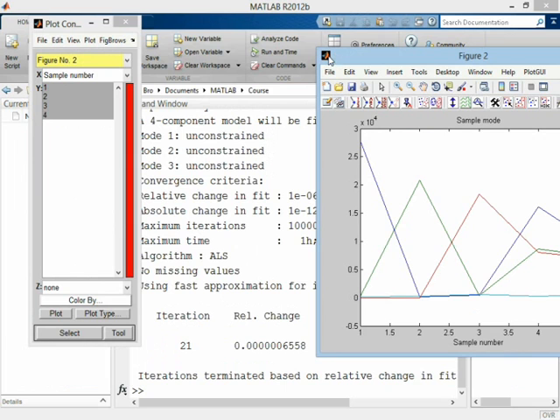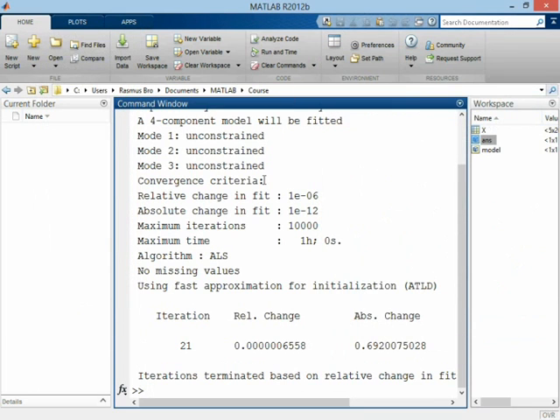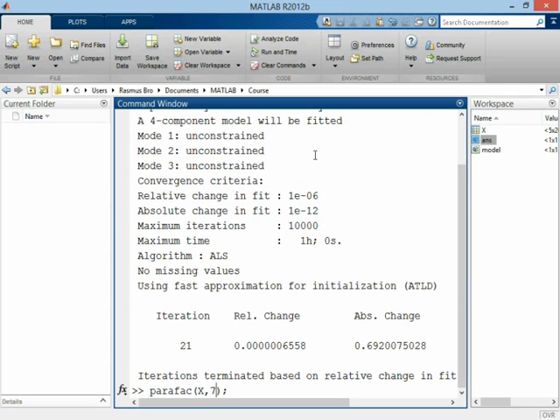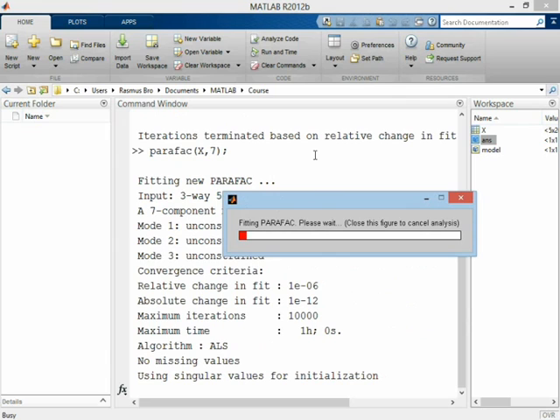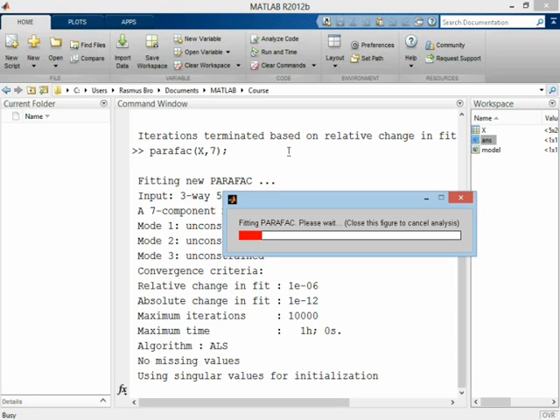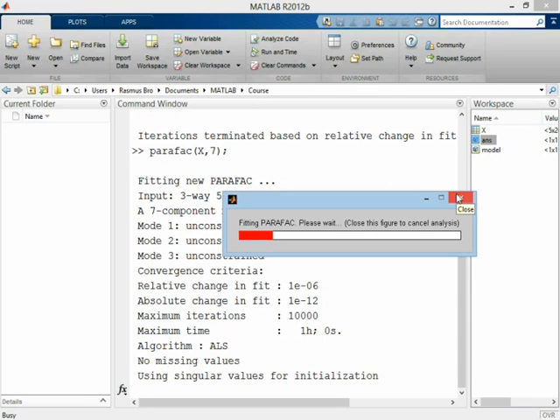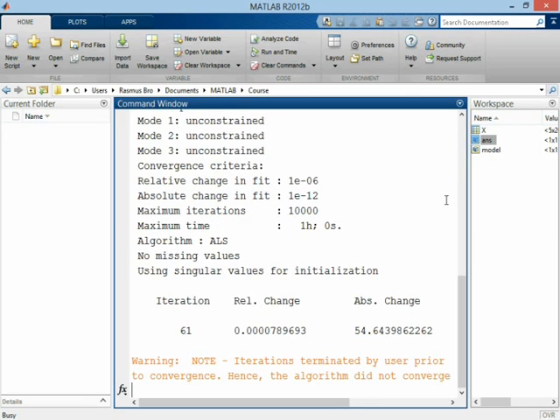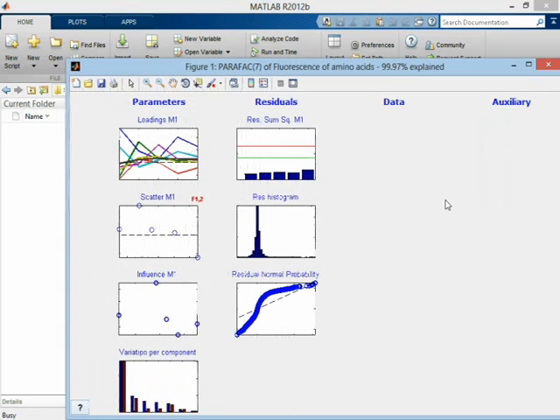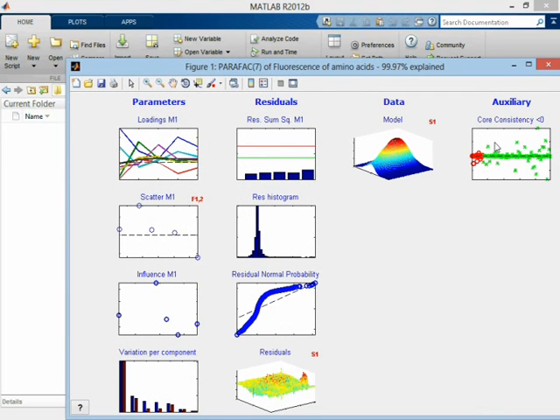Now, let me just show you one final thing. And that is that this core consistency plot will look a little bit funny if you take more components than one of the dimensions. I'll do a seven component model now. And we only have five components in the sample mode. So we have more components than samples. And it's just a mathematical issue that the core consistency problem is going to be phrased a little bit differently. And that will give you an unusually looking core consistency plot. Let me just stop this. We don't really have a solution, but let's pretend.